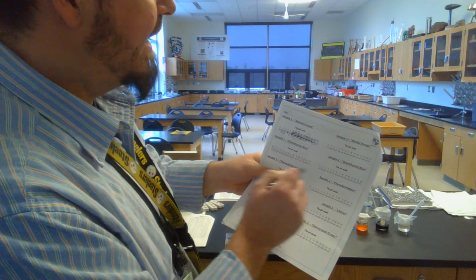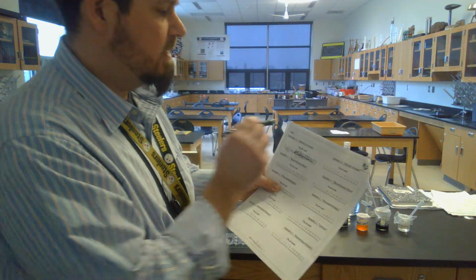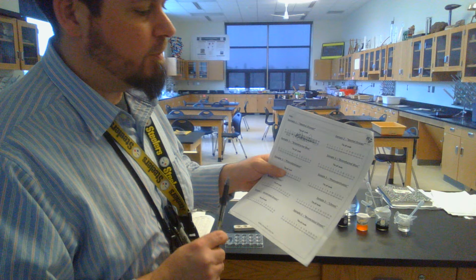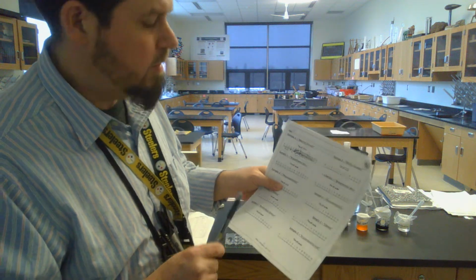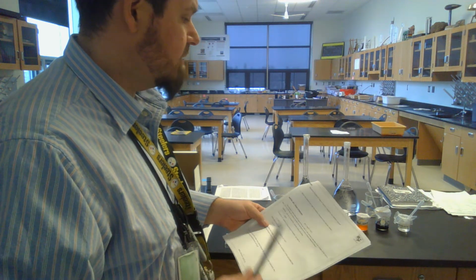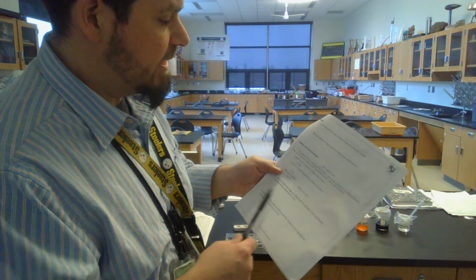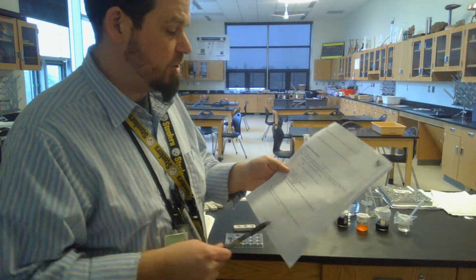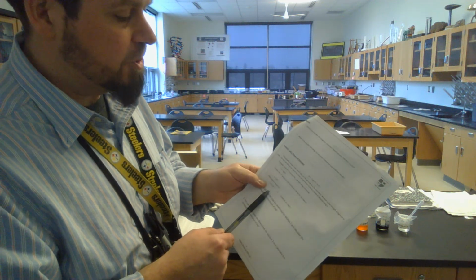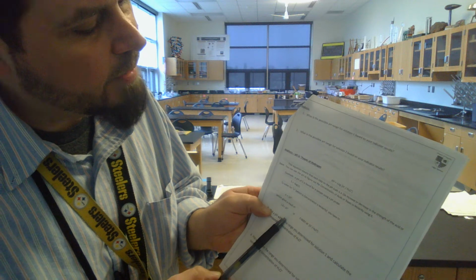We're going to block in the pieces that match up the colors so I know what pH range that particular sample is based on that indicator. And if they don't all match up perfect, you're probably still going to get 4 out of 5 or 3 out of 5 that line up where you can predict what the actual pH is. Okay. Then you have some questions to answer and to calculate your pH. And you are going to have to put that into concentration. And there's a little bit in here about the logs, remember?